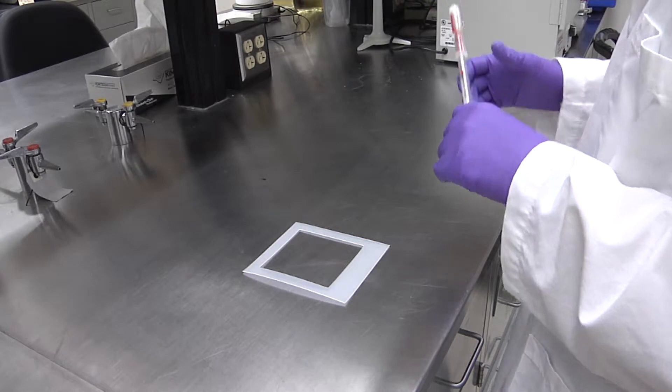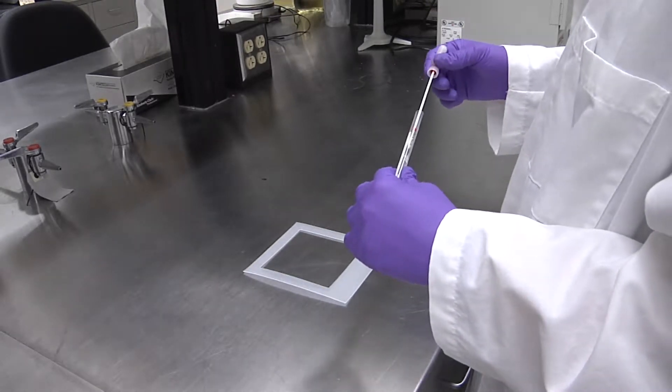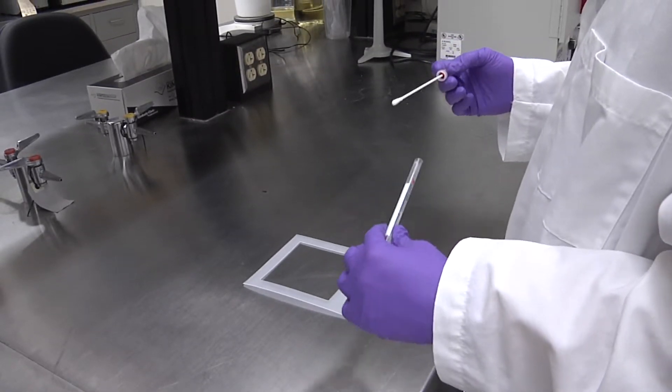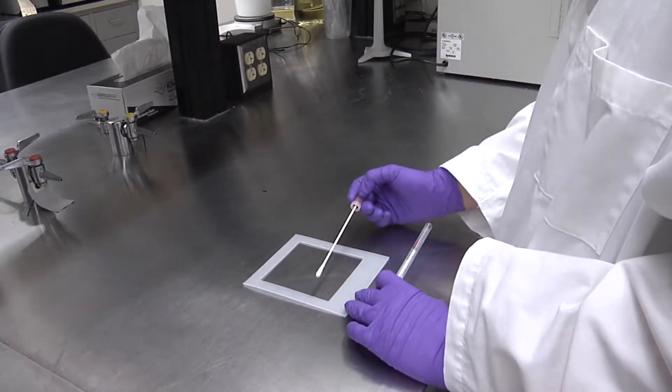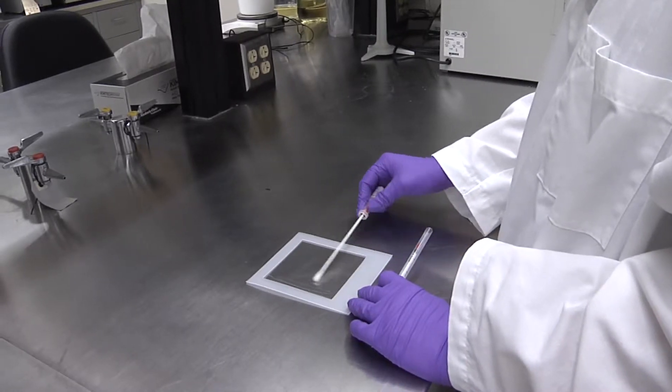To begin with, lay the sterile form on the surface you intend to test. Remove the moistened swab from the sheath without touching the swab itself. Then wipe the surface inside the form with the swab, staying within the 2 inch by 2 inch area.